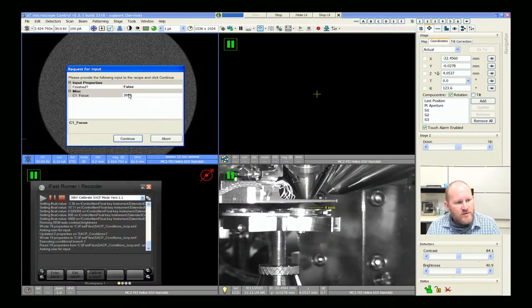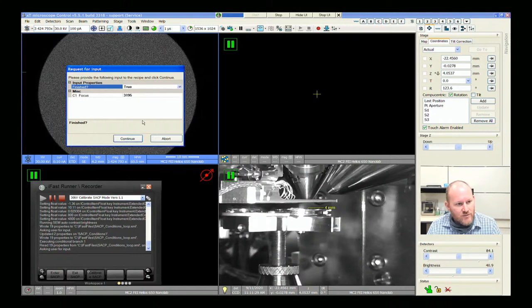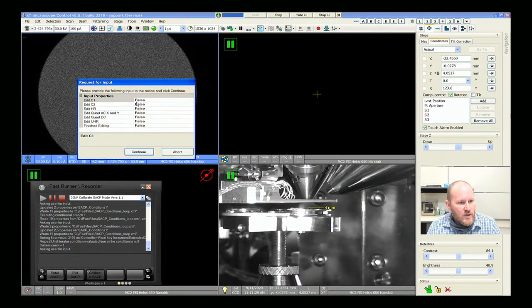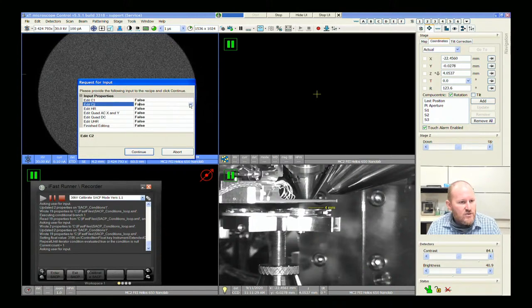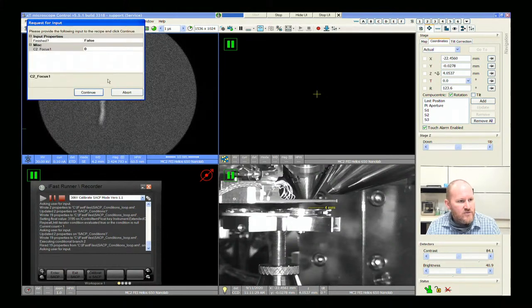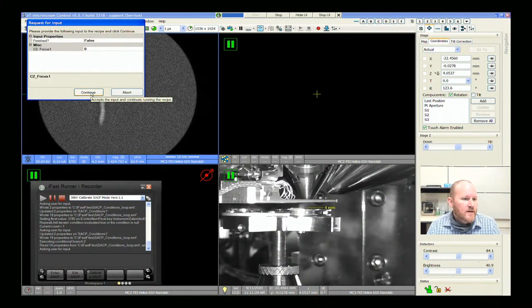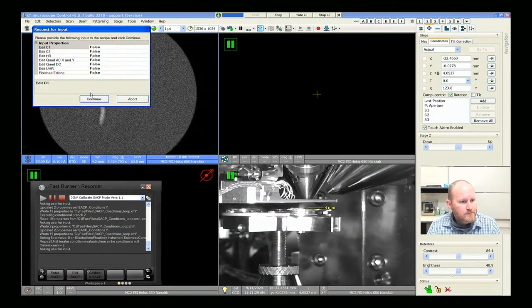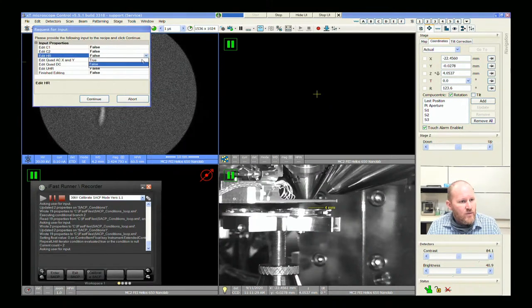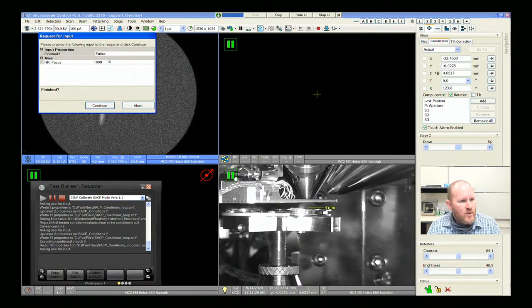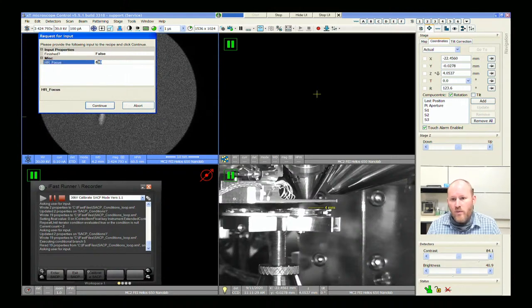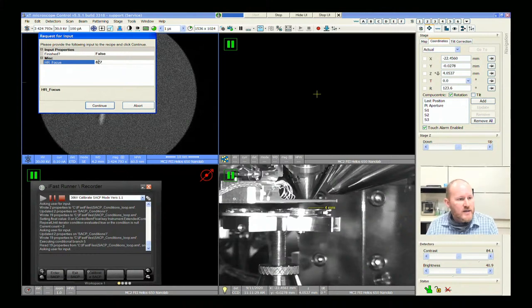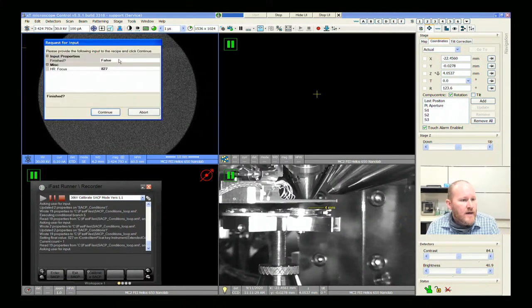I've already found what my C1 focus value will be, and I'm going to show you how I do that later. This is how our calibration script runs — we have a variable container and we need to update all of the variables. C2 should be off — I choose that I want to edit C2, continue the next step of the script. The value will be zero and I'm finished with the C2 portion.